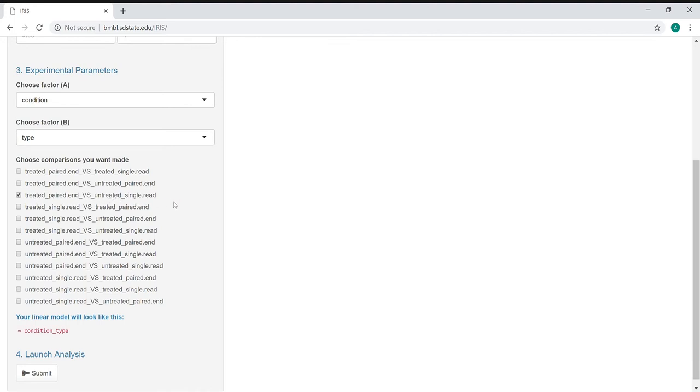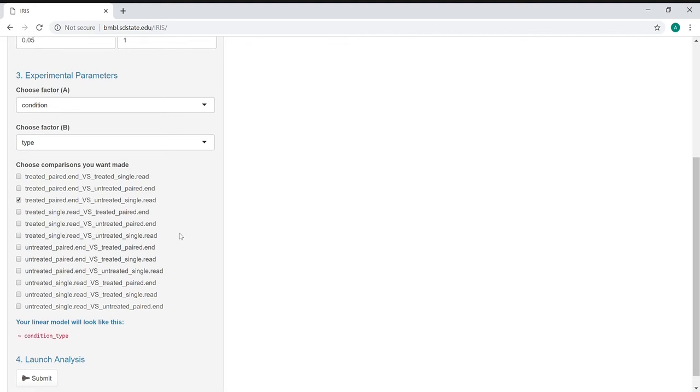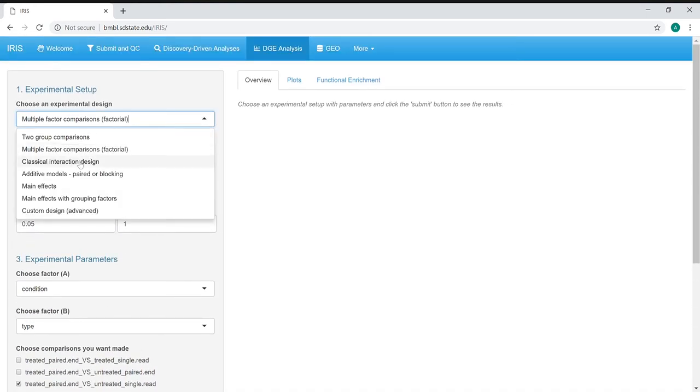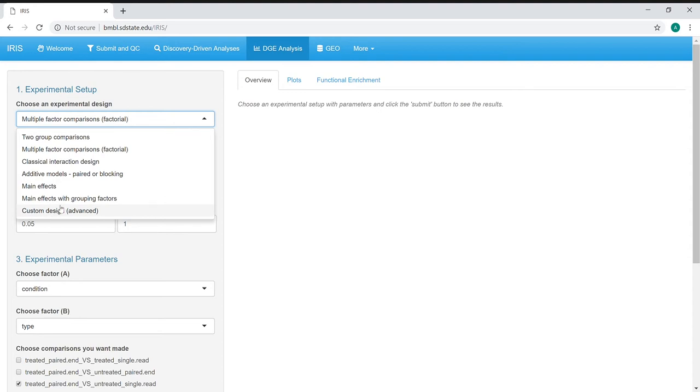We also have things like classic interaction designs, paired or blocked models, main effects or main effects with grouping factors, and a custom design that allows you to specify using a matrix of information how you want your experimental design set up if it does not match any of these factors.